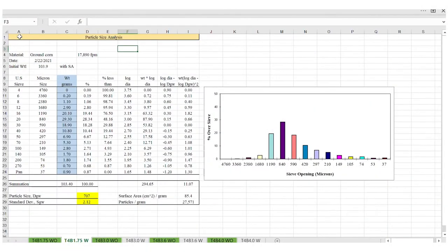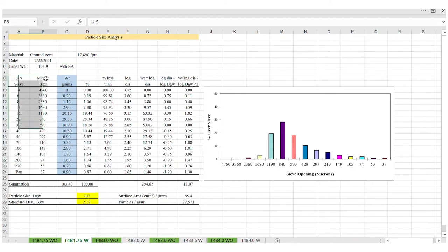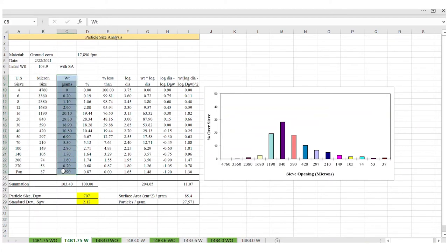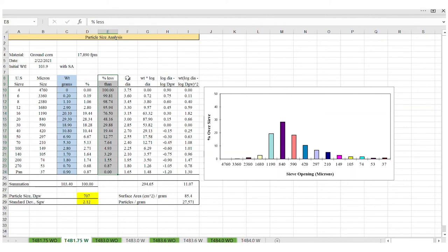This spreadsheet includes a variety of rows and columns, which include materials used, date and initial weight, and whether a sieving agent was used. The first column identifies the screen number. The second column refers to the diameter opening of the sieves in microns. The third column is the amount of feed or grain retained in each sieve. The percent column is used to create the histogram, and the percent less than column can be used when graphing using probability paper. The remaining columns are used for obtaining values that will be used in the formula to obtain particle size, standard deviation, surface area, and particles per gram.